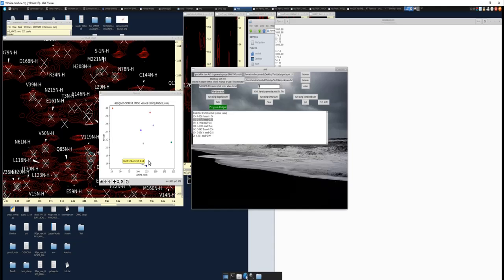Generally, I find an RMSD below 2 is a good fit. If you have an RMSD above 2 or 3, then it's probably an erroneous match, and you should not assign your protein using the Sparta predictions that you have obtained. But let's show how good this pairing system is when you have more than three. The more atoms you put in, the more information, in other words, the better and better the match you're going to get.